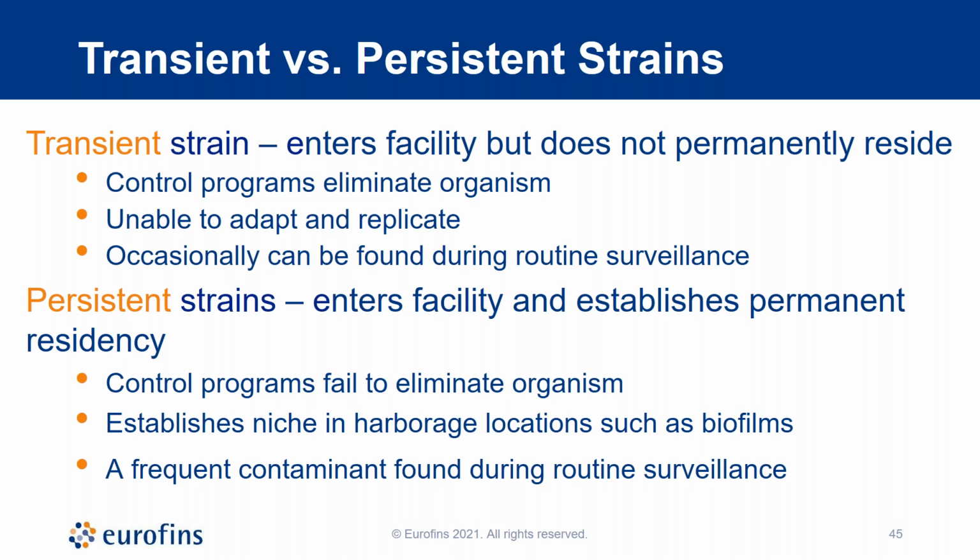So if you do find a pathogen on a surface, another argument that you have to resolve is, did that pathogen just float in on that surface after cleaning and sanitation, and land on that surface before I took the environmental sample from that surface?